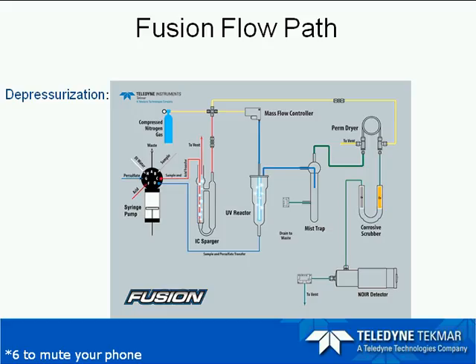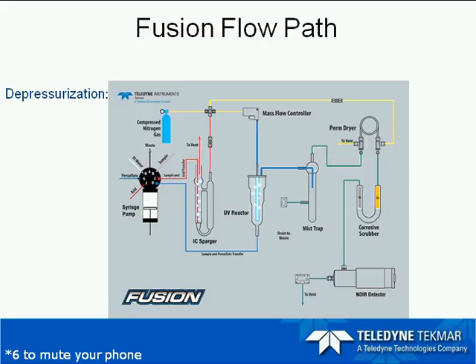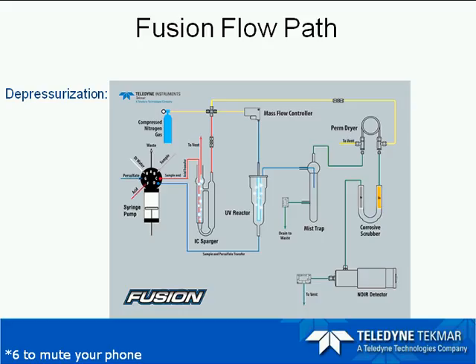So as you can see here, the system is flushing itself out. You have the thicker green line, and it is now back flushing and going back down to baseline, being ready for the next sample or sample replicate.